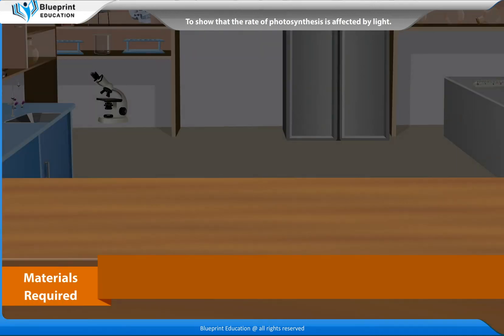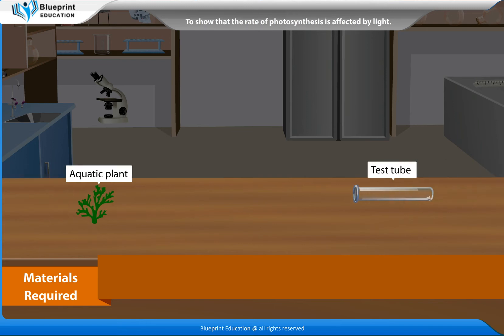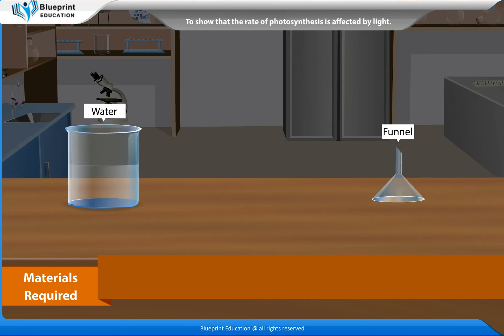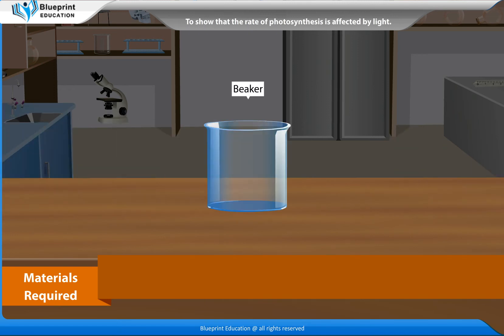The materials required are some twigs of an aquatic plant, for example Hydrilla, a test tube, water, a funnel, and a beaker.